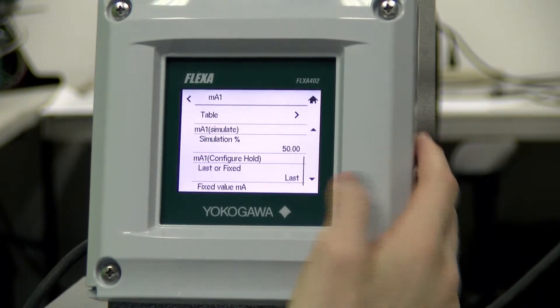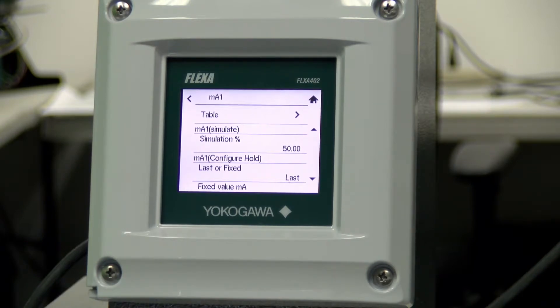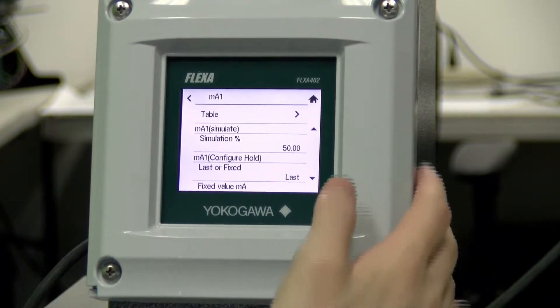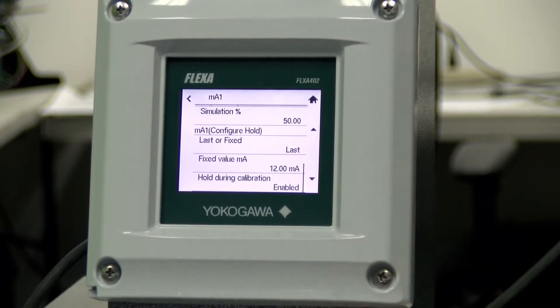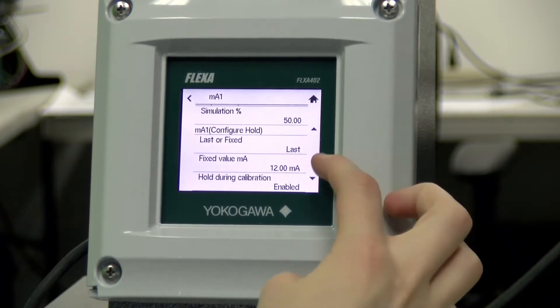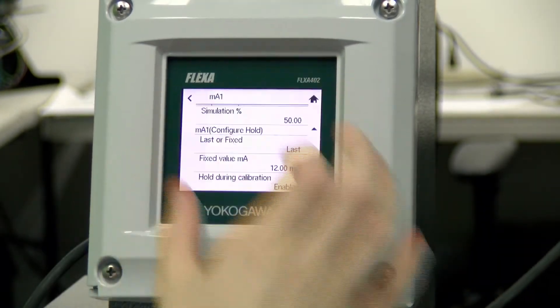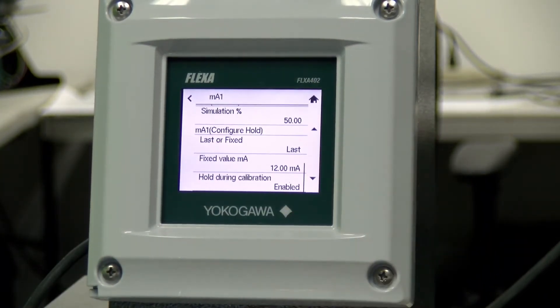Down here you can choose which percentage of the span you would like to use if you would simulate a value. So with a 0 to 14 pH span, a simulation percent of 50 would result in a pH of 7 being simulated. In addition, you can configure it to use a last value or fixed value, and here you can set that fixed value at whatever you would like.